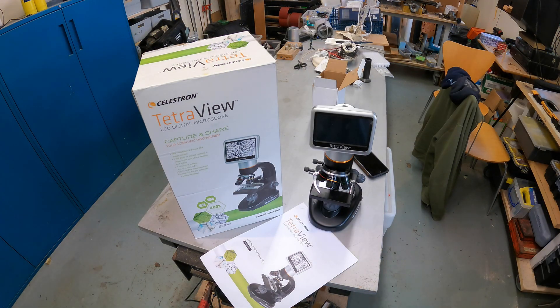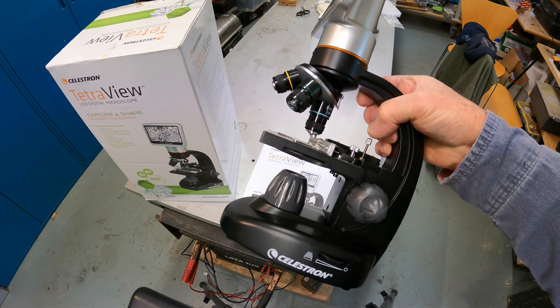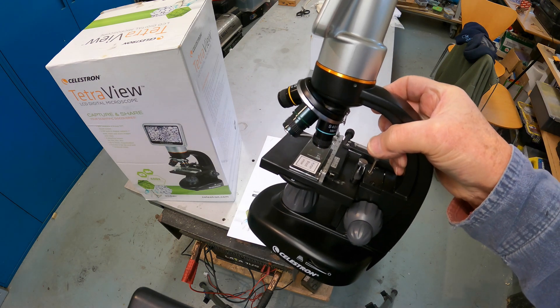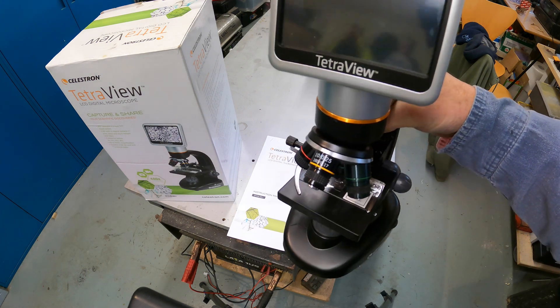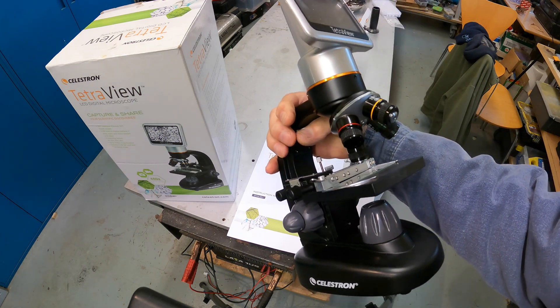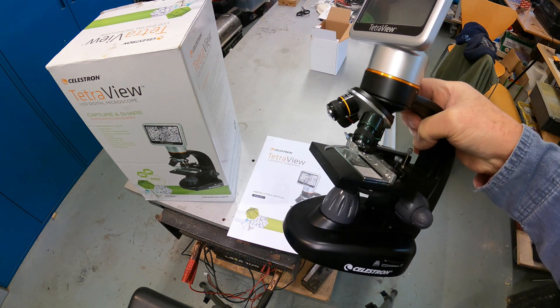I bought this for our nearly eight-year-old grandsons. Obviously it would be mum or dad operating it for them in the early days. I hadn't used a microscope before and when I first unboxed it, it wasn't that intuitive to use and it took a bit of studying before I understood the setup and the controls. So with this little video, I hope I can show the boys and their mum and dad how to get into it a bit quicker than I did.